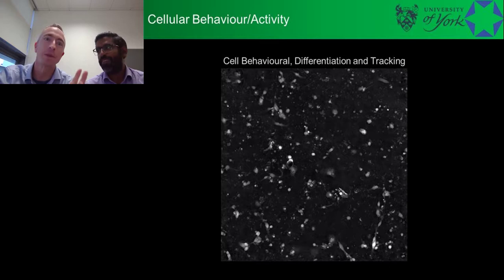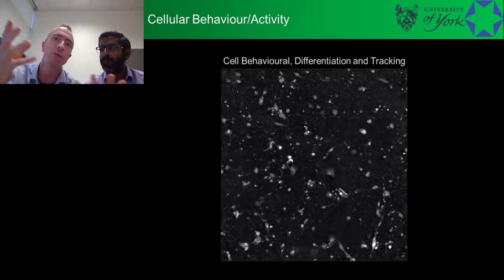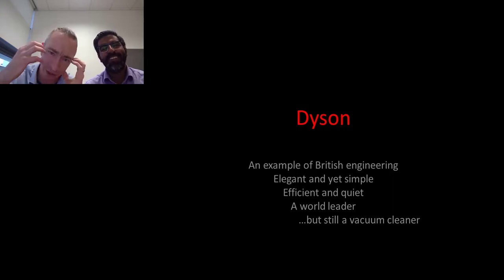But that cell that went off, that you had those two daughter cells, call them sisters because they are sisters, that were meant to be identical, but obviously had asymmetric division, were very different in their behaviors. And the cell that got the munchies, we actually gave a name to. We give ourselves names because it kind of helps us identify with them. And we call this cell Dyson.